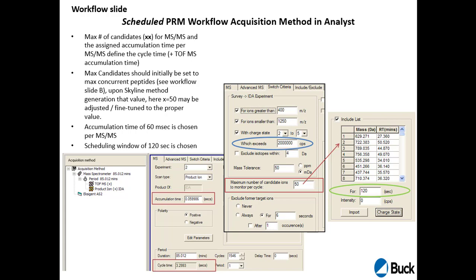So that's some kind of workaround that they had made, which is maybe not that elegant, particularly when you try to explain it. But basically you set the threshold so high that it never would automatically trigger anything from the inclusion list. And if that is true, then it just marches through the inclusion list to do anything. So anyway, that has worked really, really well.